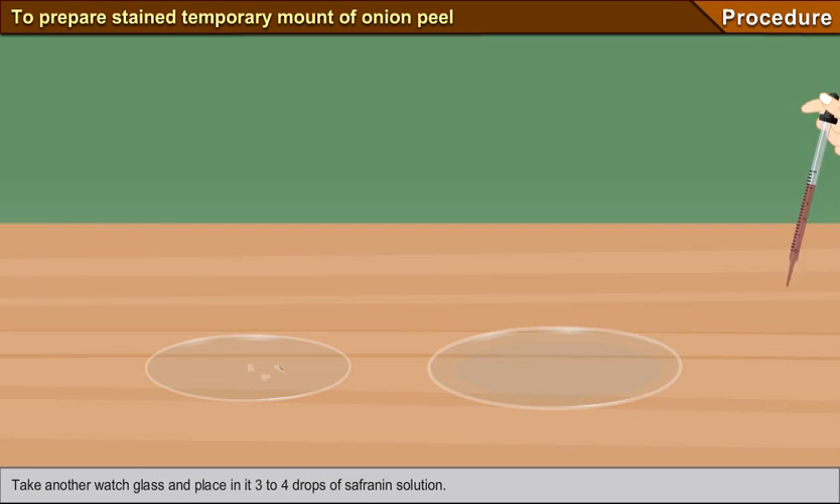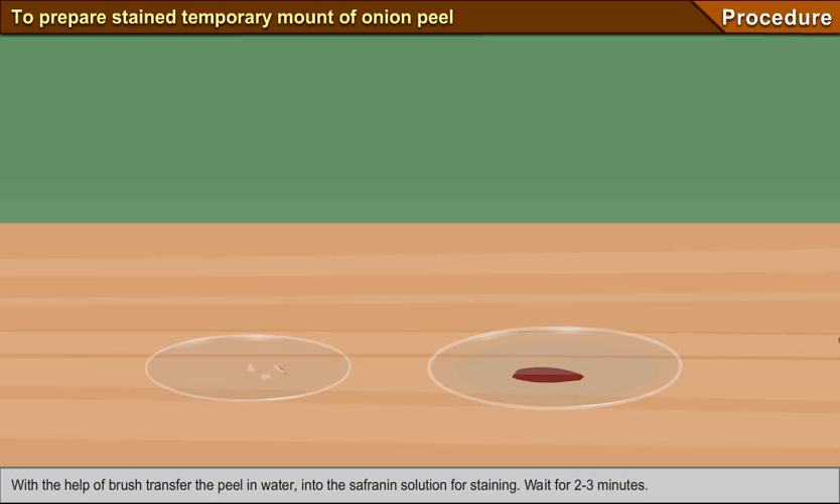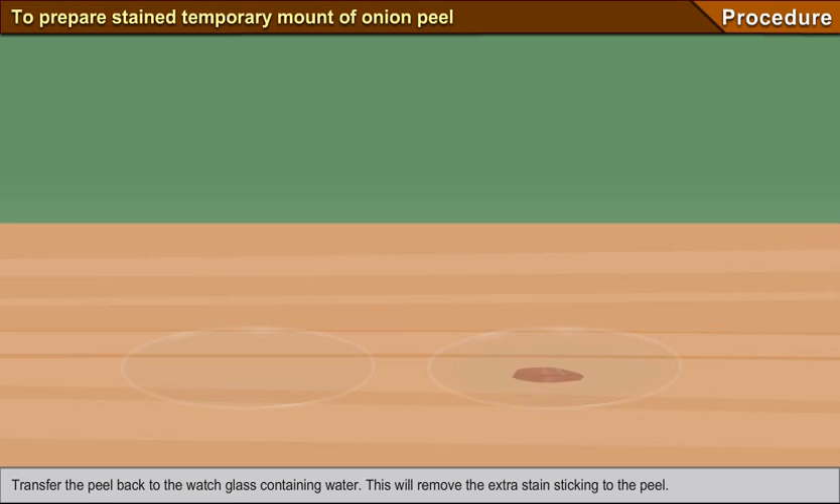Take another watch glass and place in it three to four drops of safranin solution. With the help of a brush, transfer the peel from water into the safranin solution for staining. Wait for two to three minutes. Transfer the peel back to the watch glass containing water — this will remove the extra stain sticking to the peel.